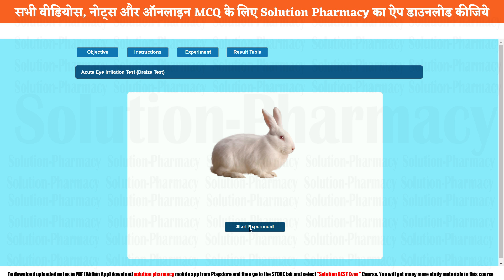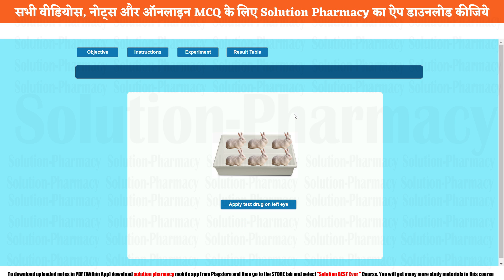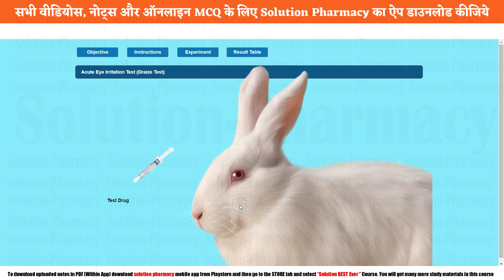Now click on the button 'Start Experiment.' Once you click that button, you will find the rabbit as the experimental animal. We are not going to divide it into a group because we have to perform only a single test — the eye irritation test on one eye. The rabbit has a pair of eyes and we are going to apply the drug on a single eye, so there is no need to separate into a group. The next step is to apply the test drug on the left eye.